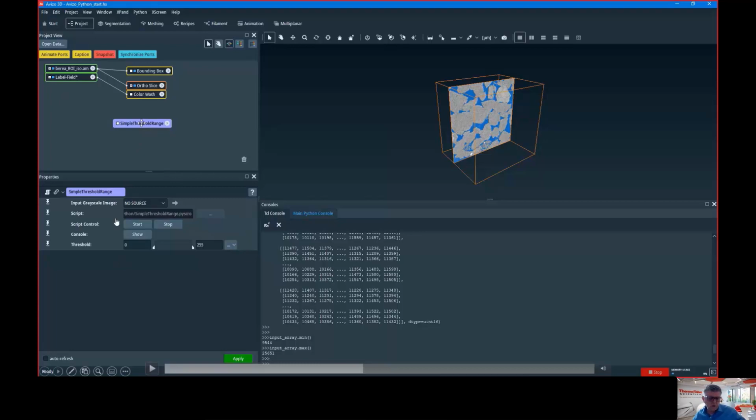If there is a mistake in the code, which is very common at the beginning when you start writing it, you will get error messages popping up telling you the line number and the error. So you will have to go back to your text editor and modify. If you don't know exactly the syntax of something, you play in the console. So the console is the place where you can do your first steps.